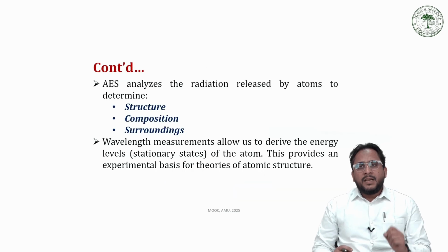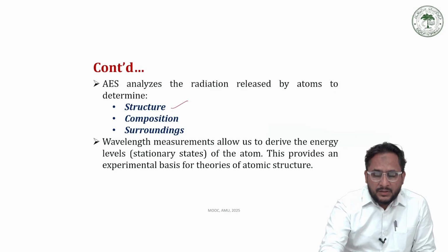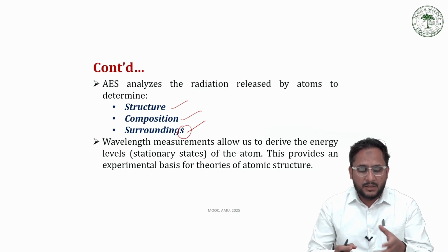Based on the light emitted by these relaxation phenomena, we can identify the structure of the compound, the composition of the sample, as well as its surrounding environment, what other elements or groups are present in the sample.